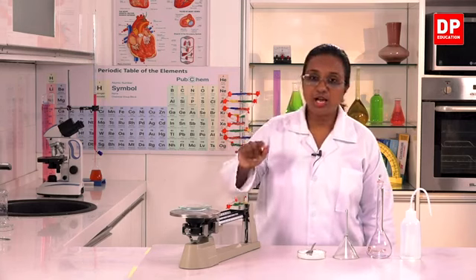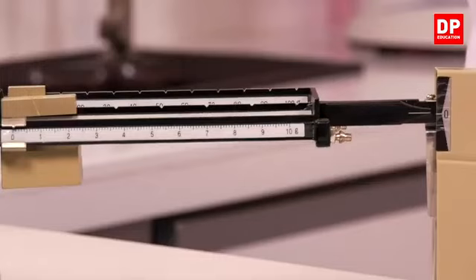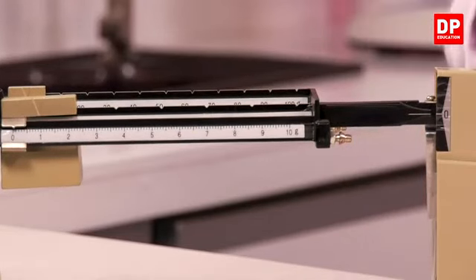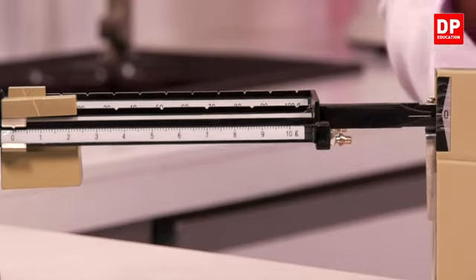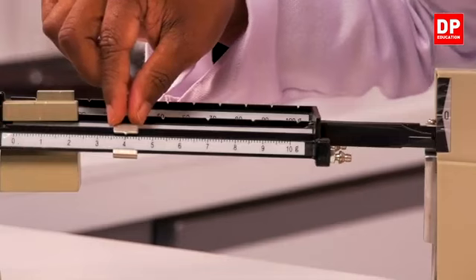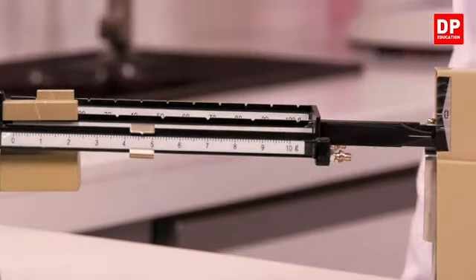With the watch glass, I have balanced it to 0. So you can see the 0, the balance is at rest. It's pointing to 0 with the watch glass. Now I need to set the value to 14.6 grams. So here, 14.6 grams.